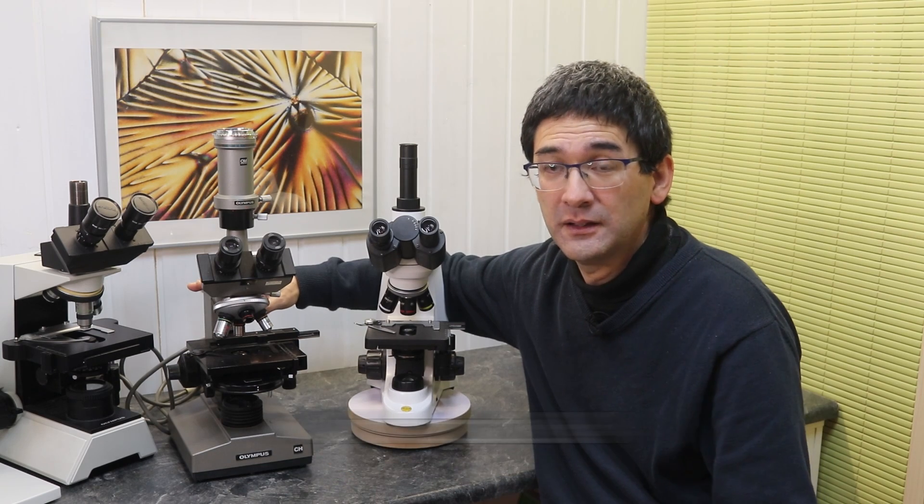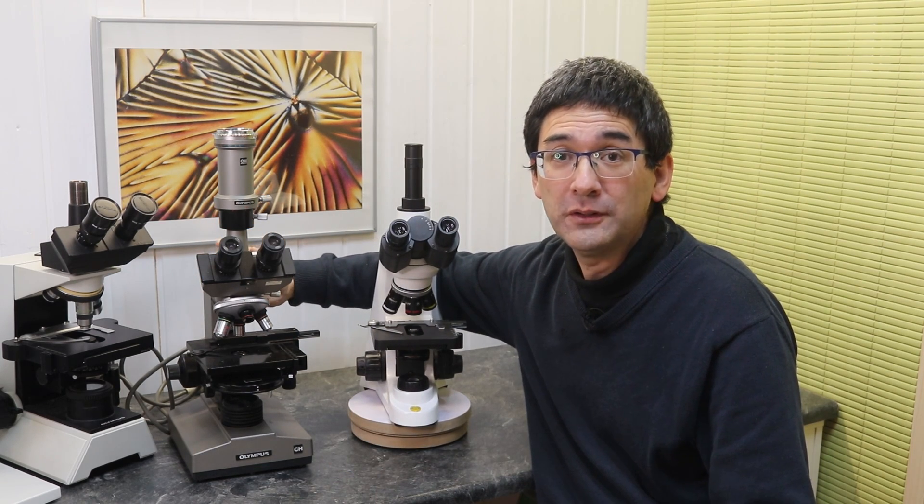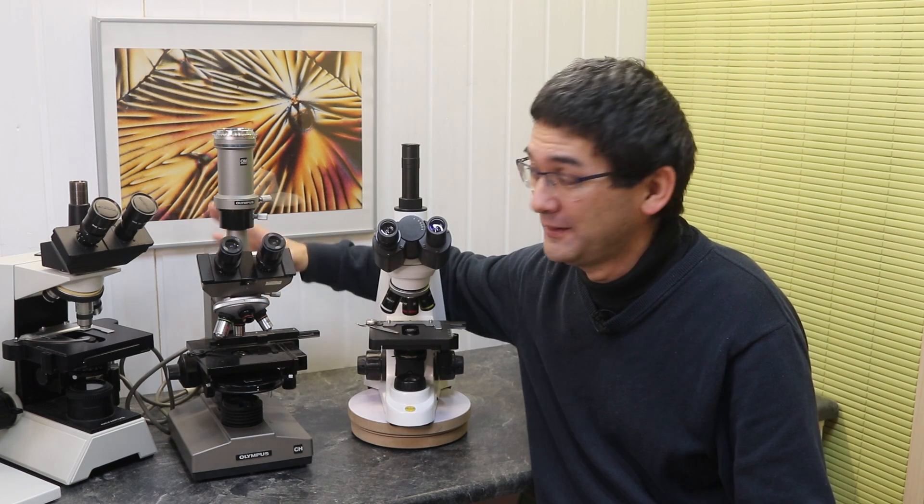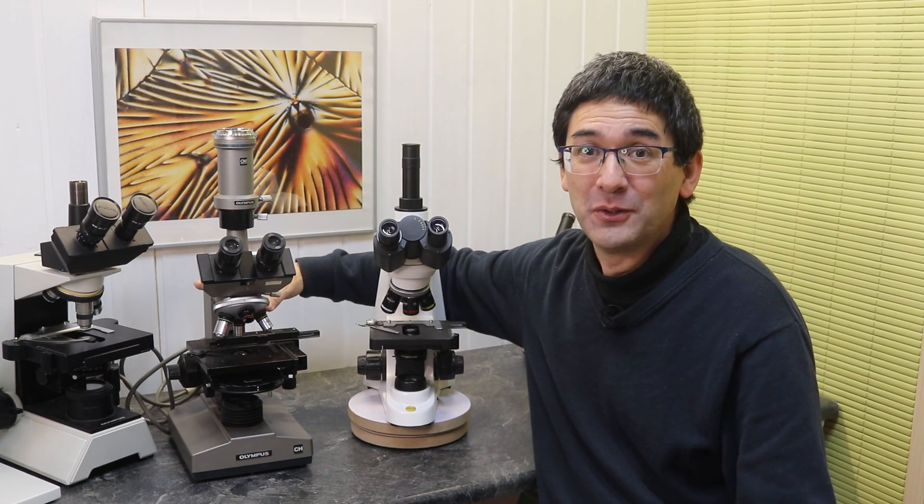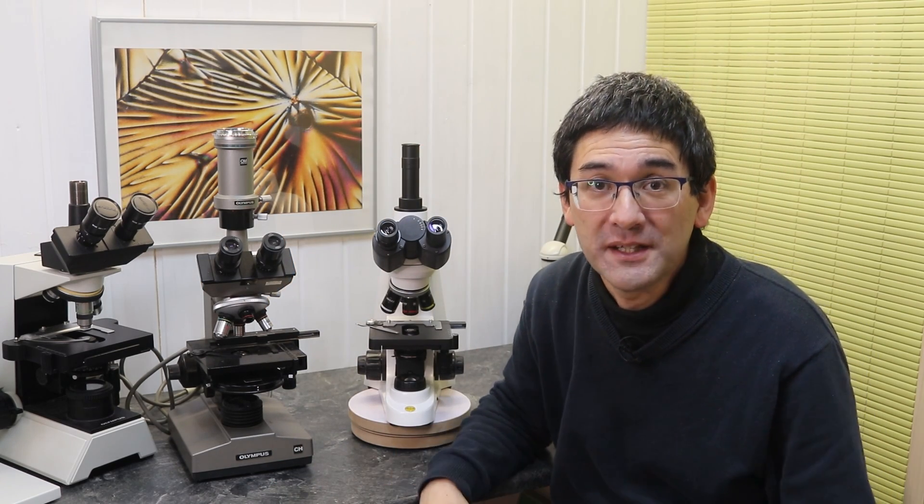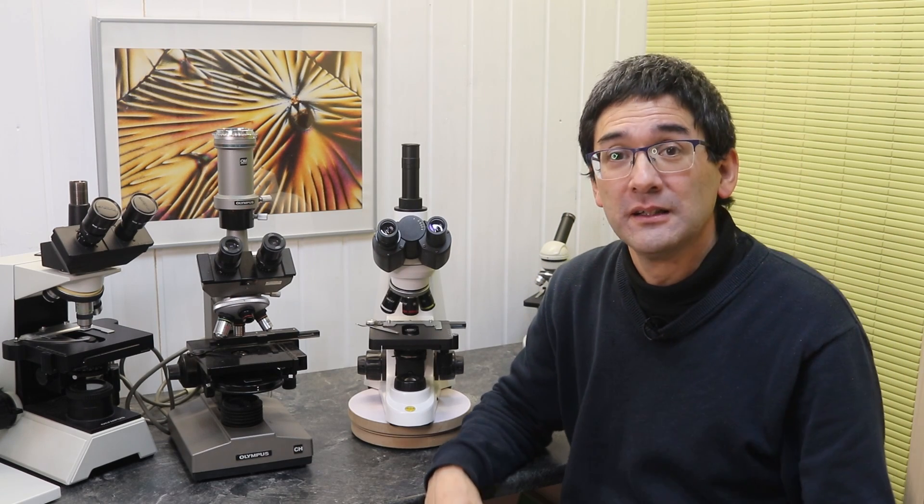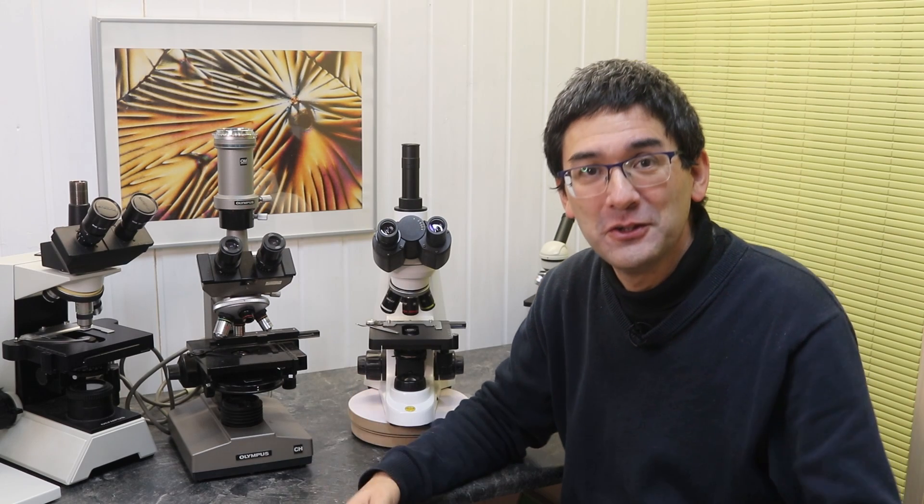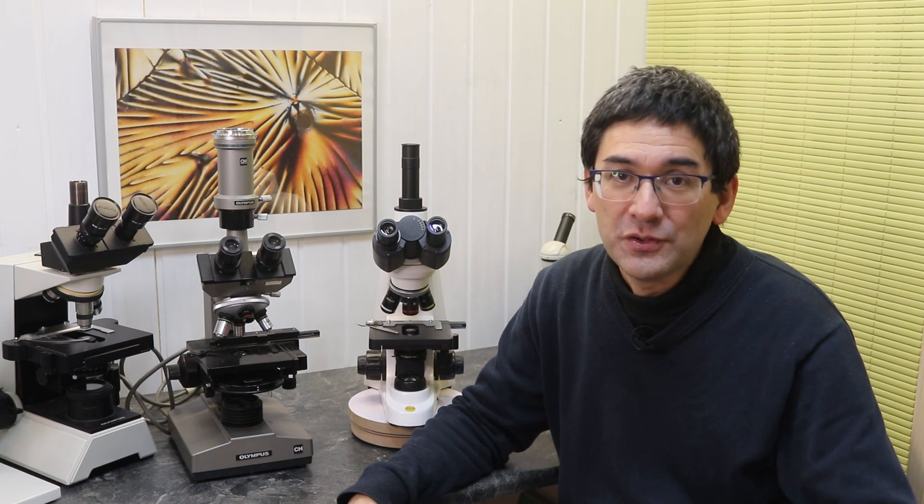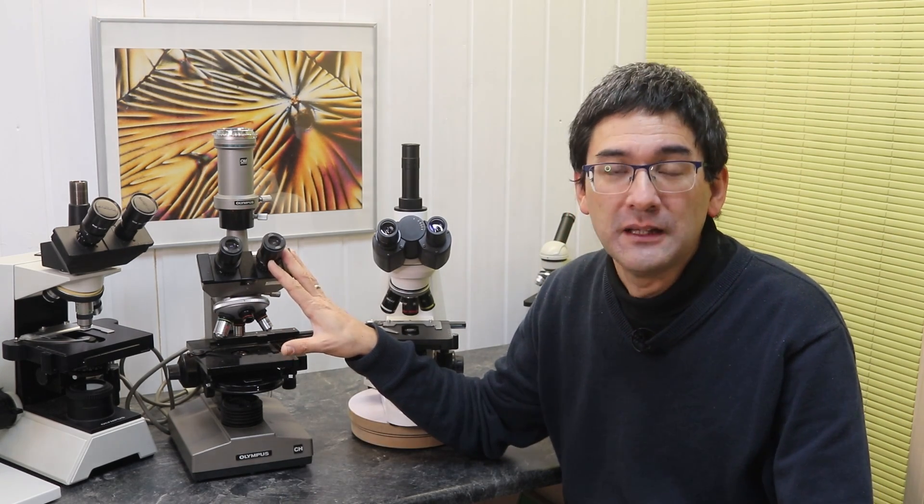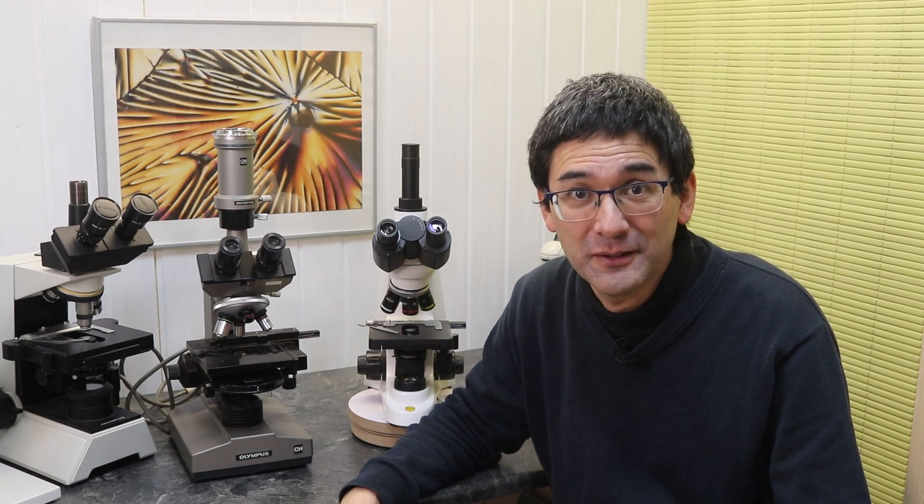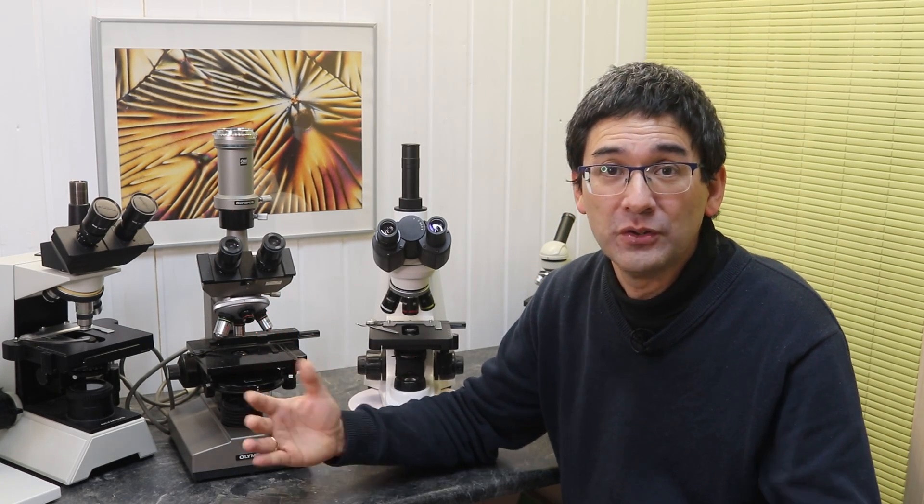Over here, this one is from the 1980s, the Olympus CH microscope model. This is a brand model and even though it's over 40 years old, I had it refurbished by an authorized Olympus service shop and it works just like on day one. So what is the better option now considering that both of them have the same price?